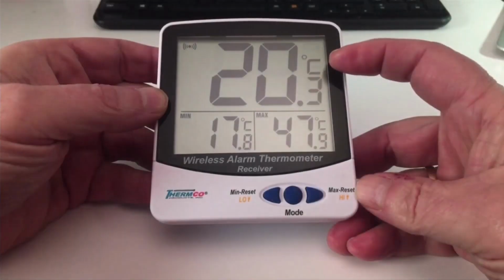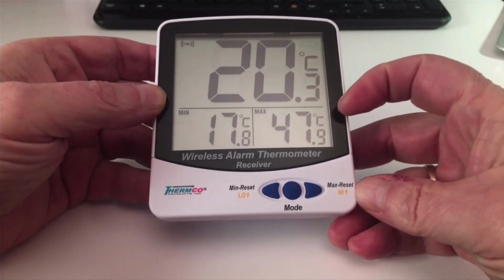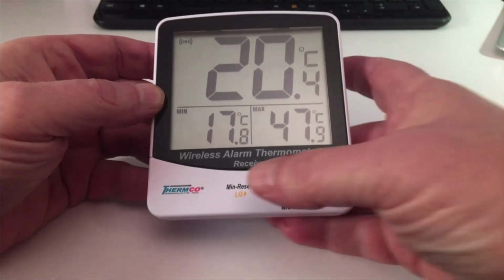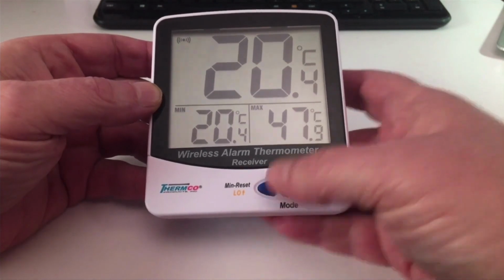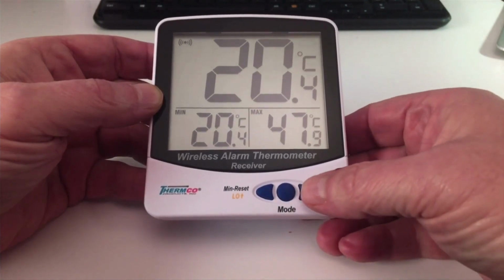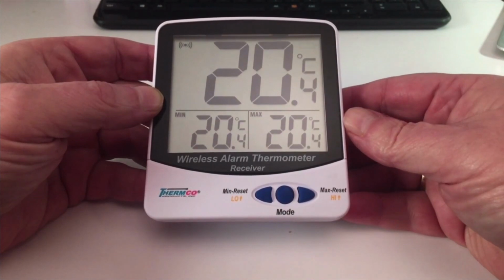Our current temperature is 20.3 degrees. Our min is 17.8. Our max is 47.9. And now we want to reset the min and max. All that is necessary is just press the min reset, and that sets it to the current temperature. And if you want to reset the max, just depress the max reset button, and that also now reflects the current temperature.